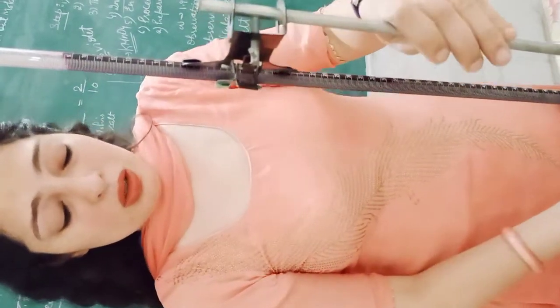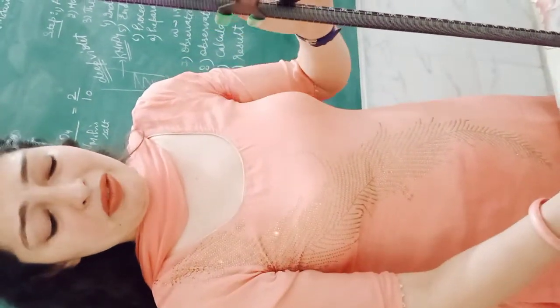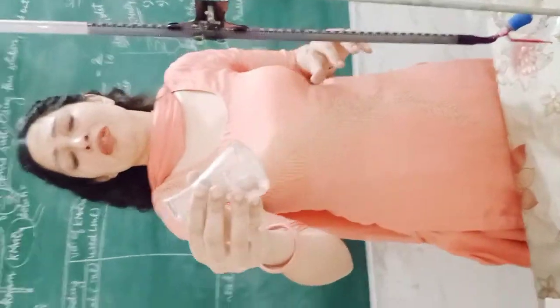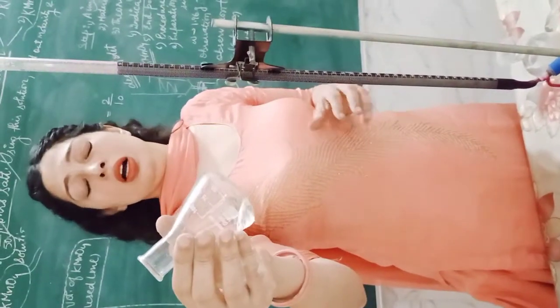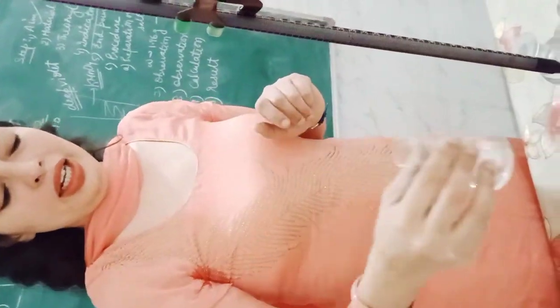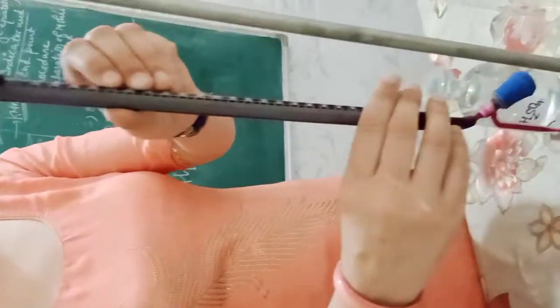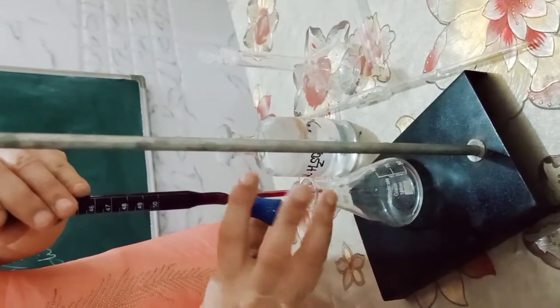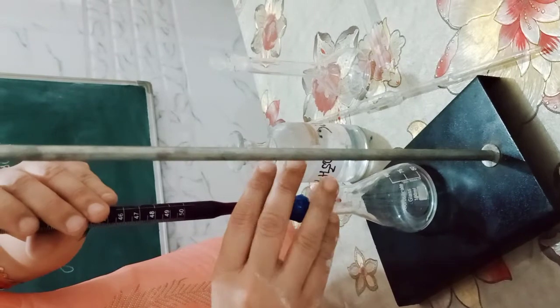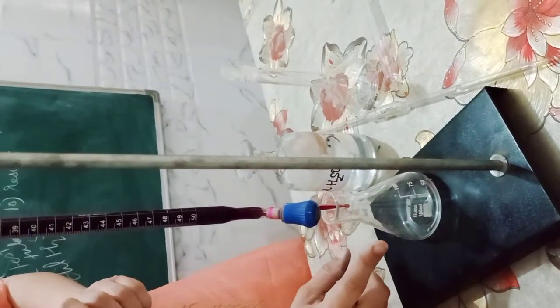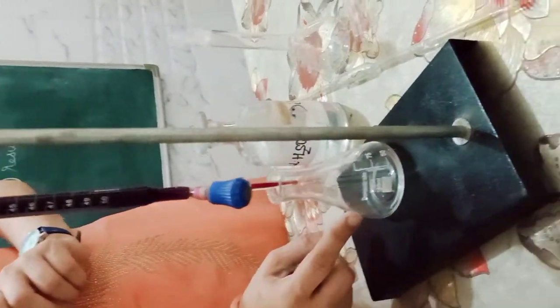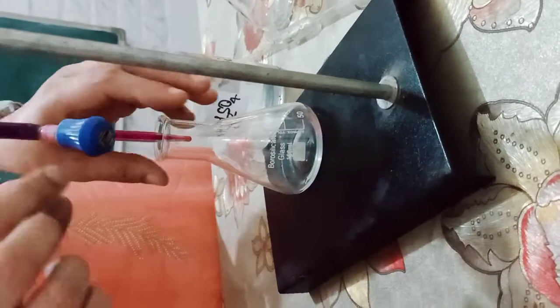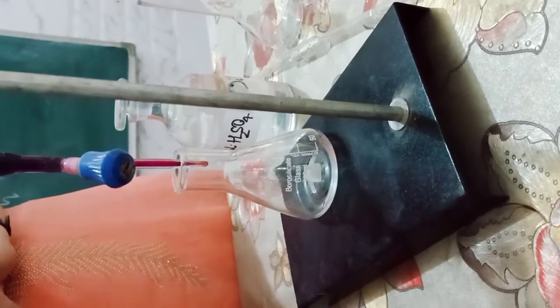So here I have put the Mohr salt into the conical flask and added dilute sulfuric acid. Now, you will arrange the burette so that the tip is centered over the conical flask — which we call the titration flask — placed in the center.